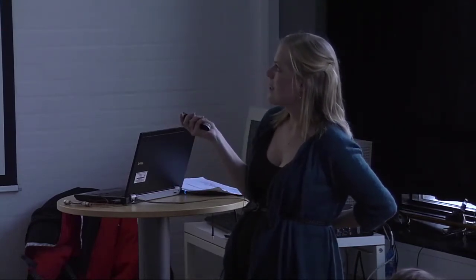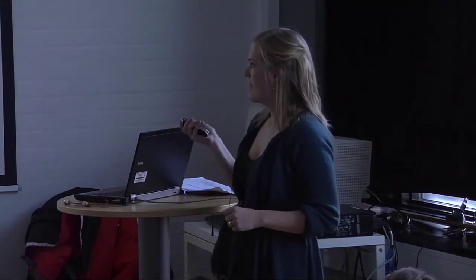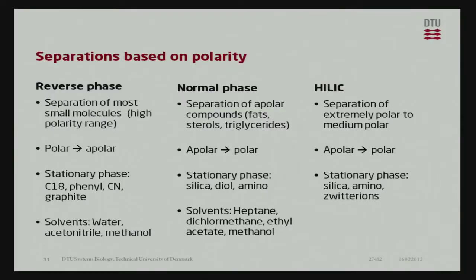Like normal phase, it got great affinity for the polar compounds. So the apolar ones will be pushed through the column much faster, and then the polar ones will stick. And the stationary phases actually resemble a lot the ones that we use in normal phase. So it's silica, amino phases, zwitterions, so different phases that can carry both a positive and a negative charge at the same time. But the huge difference compared to normal phase is the solvents that we use. So in normal phase, we got the very apolar solvents, heptane and all that, which we can't use for making ions.